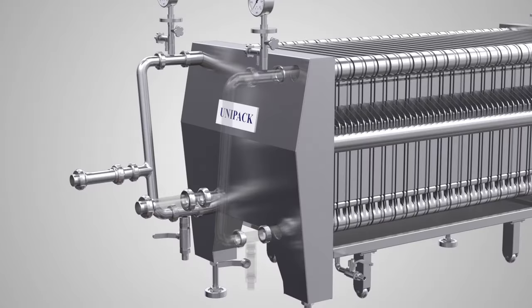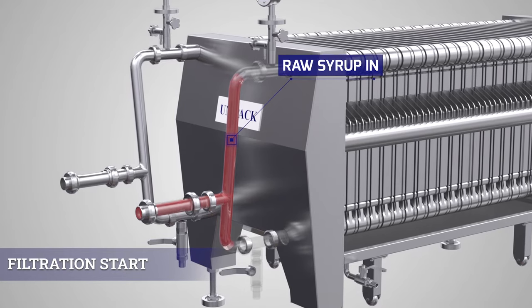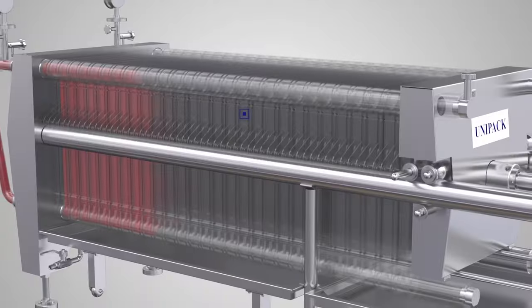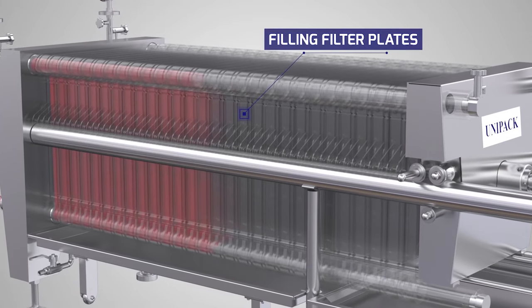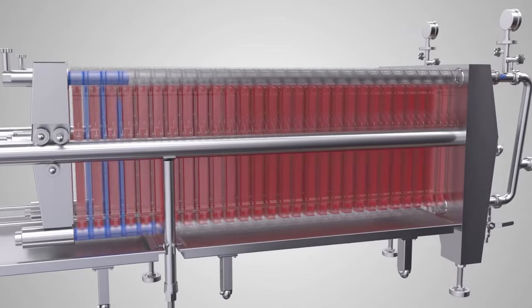The unfiltered liquid is fed to the inlet channel, formed through the sockets on the frames, under pressure using a pump or pressure in the feed tank. It travels through the opening in the frame sockets and the filter paper to deliver the filtered liquid from the channel formed by the sockets on the plates.